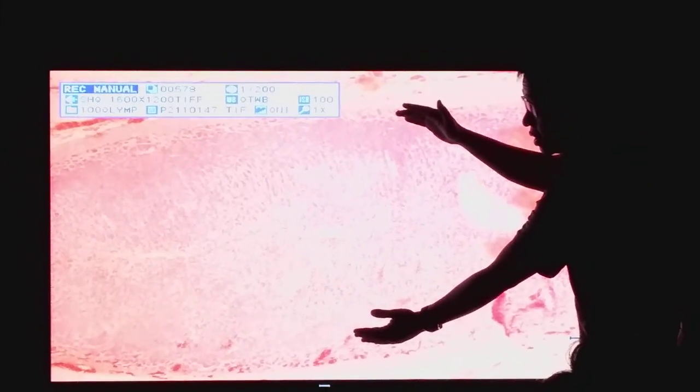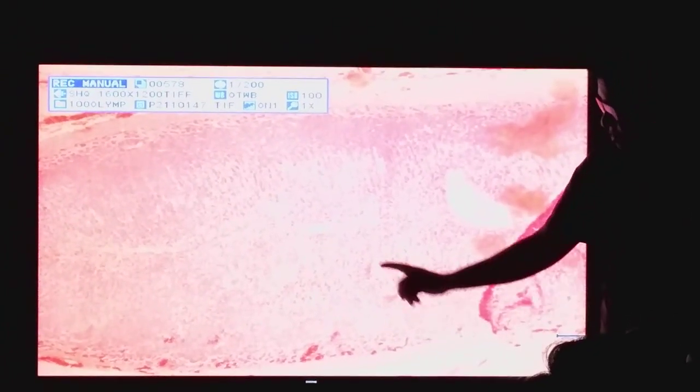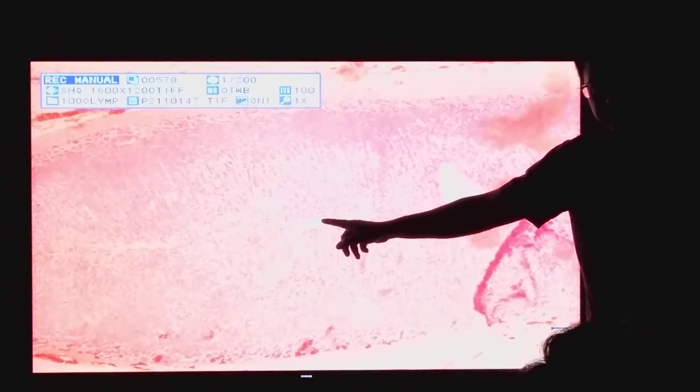It is softer than the cortex because of the presence of blood vessels. In the cortex, it is solid because, as you can notice, it is entirely composed of cells and few capillaries, because this is an endocrine organ. Large blood vessels are present in the medulla.